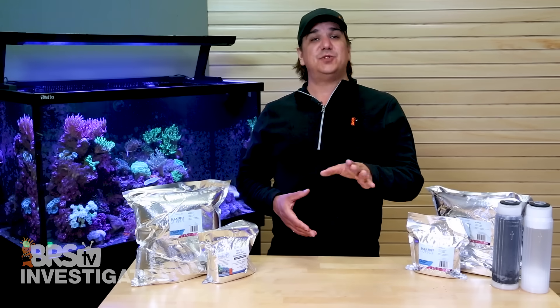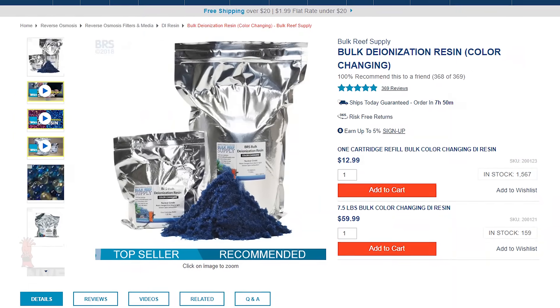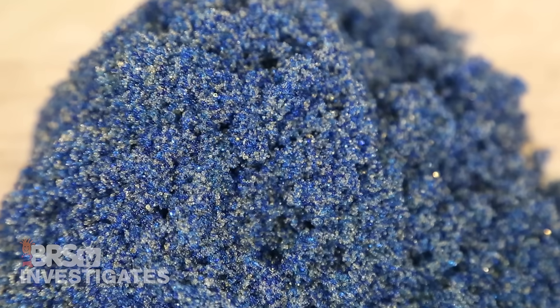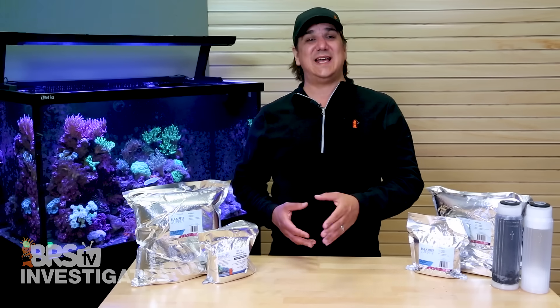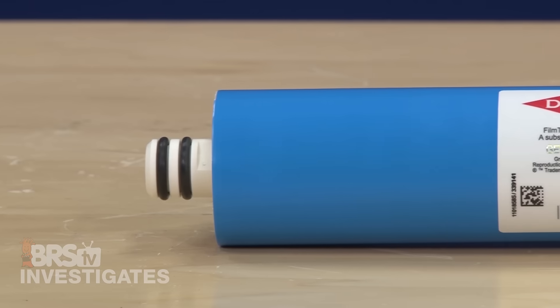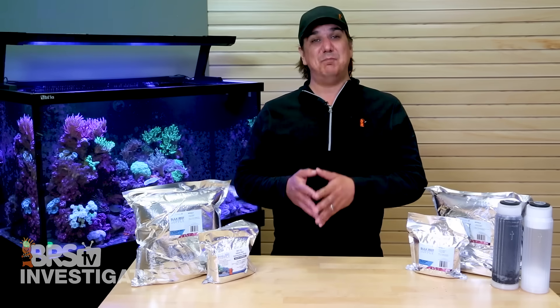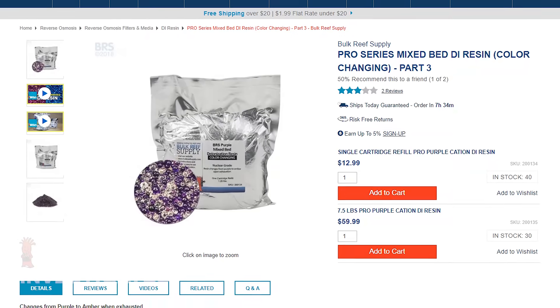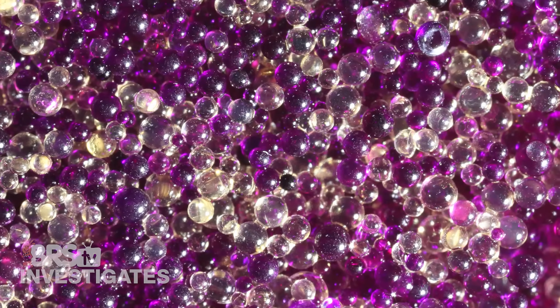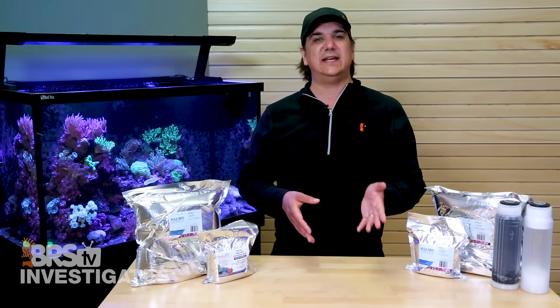These are not something any reefer wants when mixing fresh saltwater or replacing evaporated water. So we are performing two tests. The first uses the standard blue bulk mixed bed resin and tests for silica until complete exhaustion. We use the blue mixed bed because the color-changing dye is in the anion resin, giving us the best visual reference for anion exhaustion and silica performance. We pump straight tap water through at 200 milliliters per minute — about the same contact time and flow rate as a 75-gallon-per-day membrane — and measure silica levels all the way past depletion. Then we do the same with the purple pro series mixed bed resin and test for ammonia, as it has the cation dyed purple for the best visual reference of cation and ammonia performance.